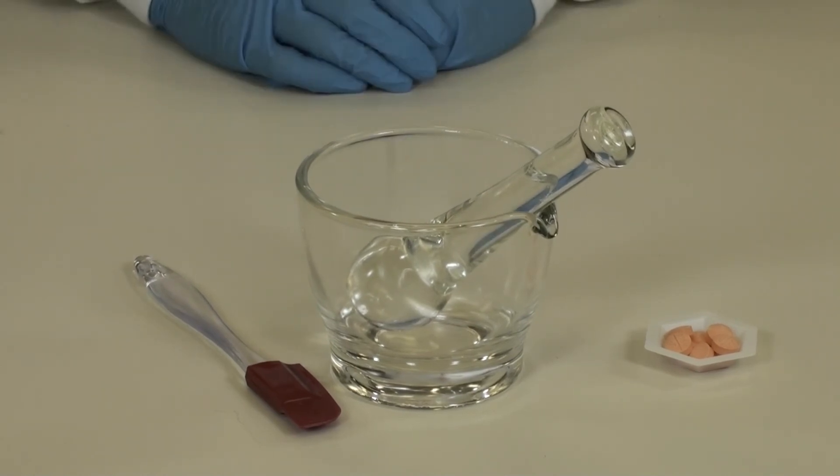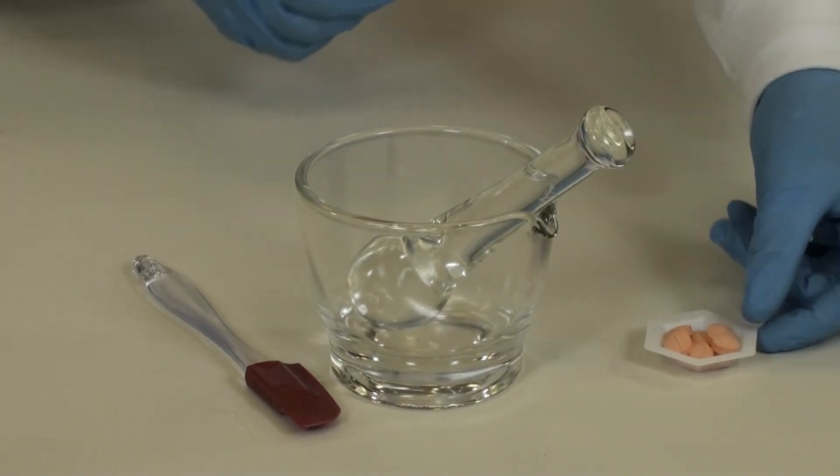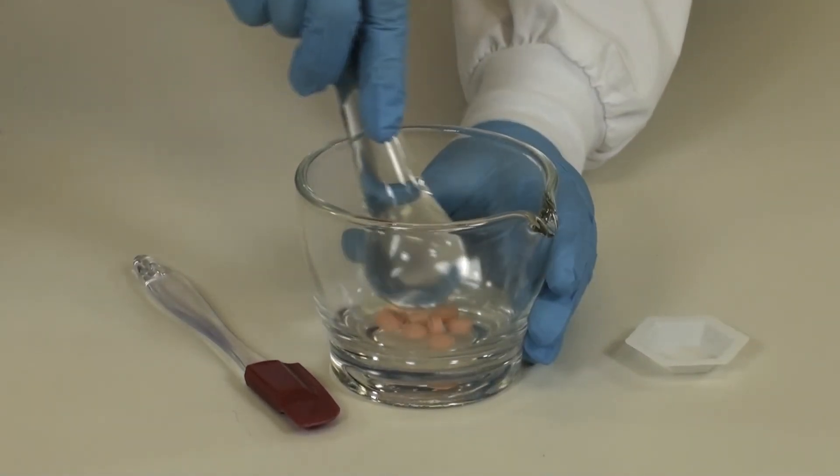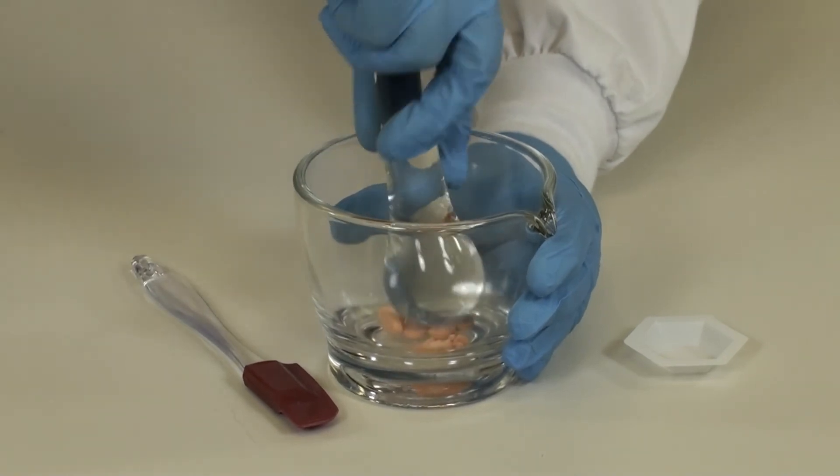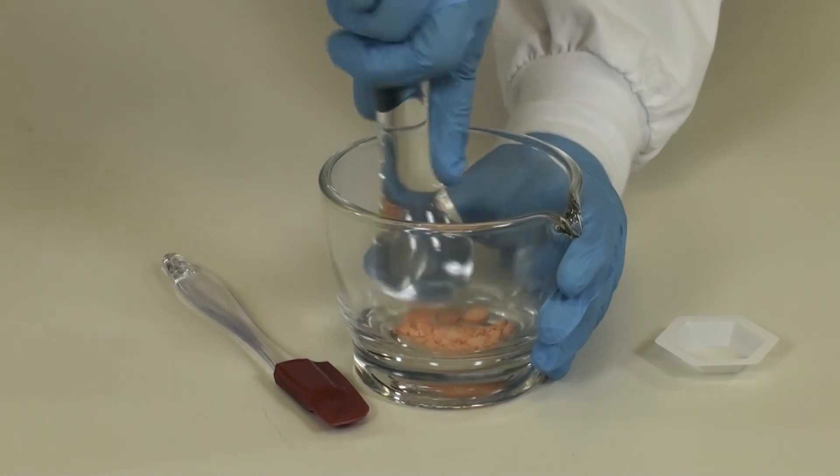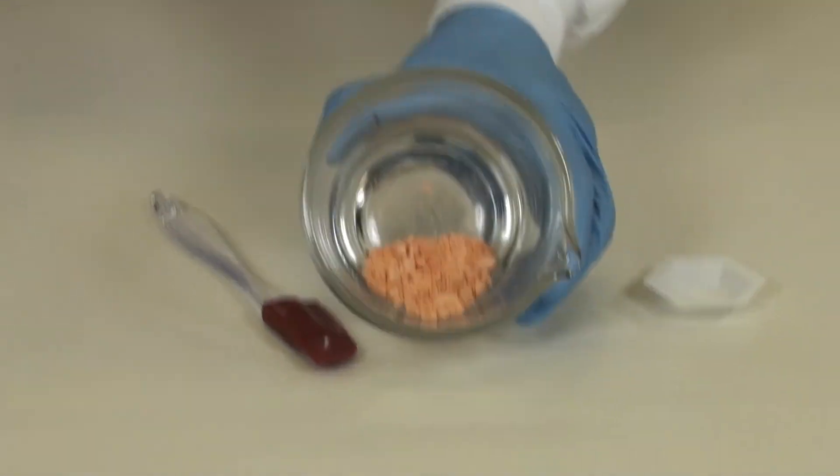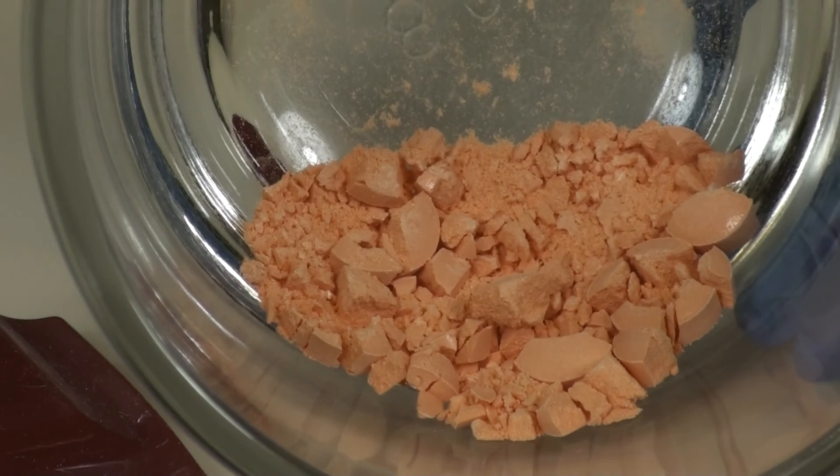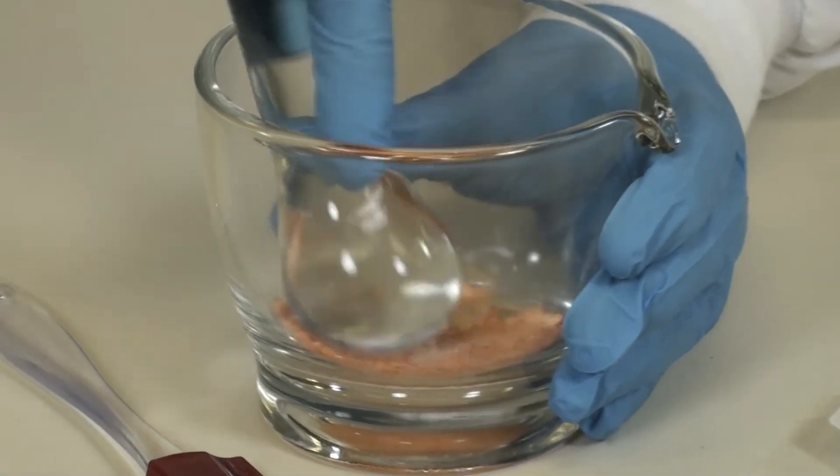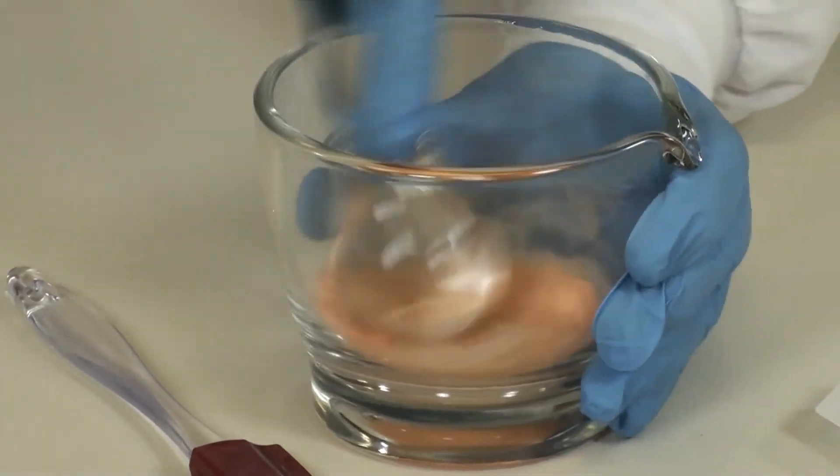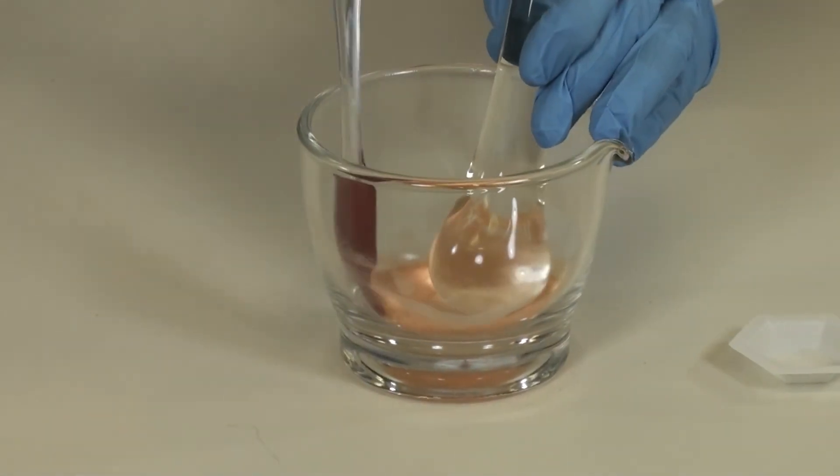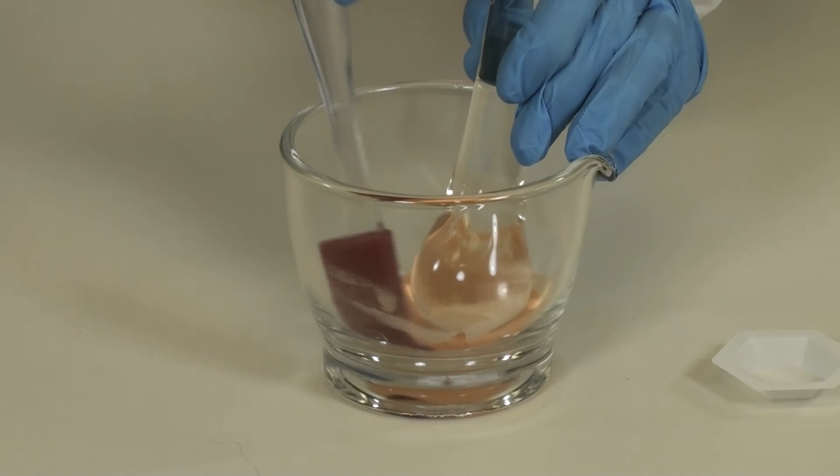Place the required number of allopurinol tablets in your mortar and triturate those to a fine powder, remembering to use a firm twisting motion to initially start the trituration process with the tablet. Continue to triturate until you have a very fine powder. If you need to move the powder down off the sides and back to the center of the mortar, use your rubber spatula.